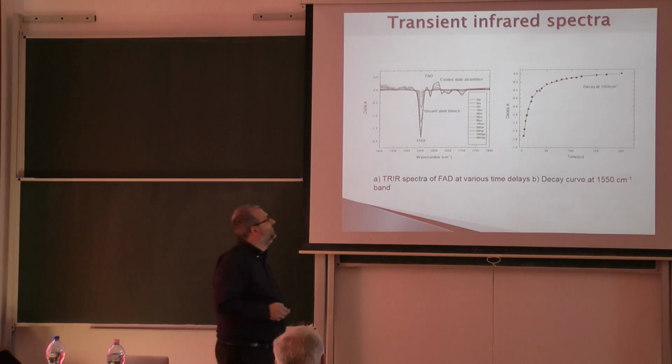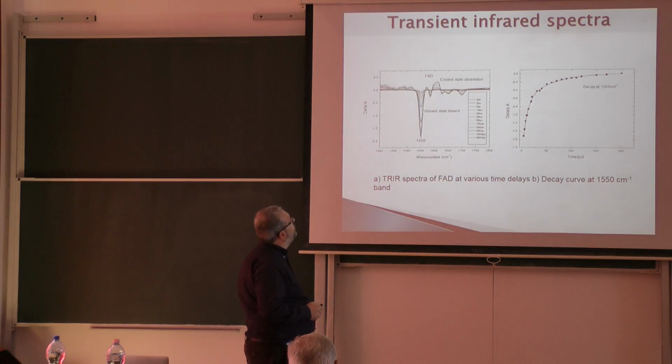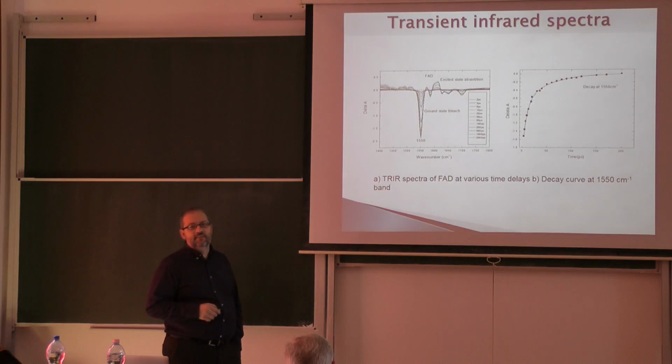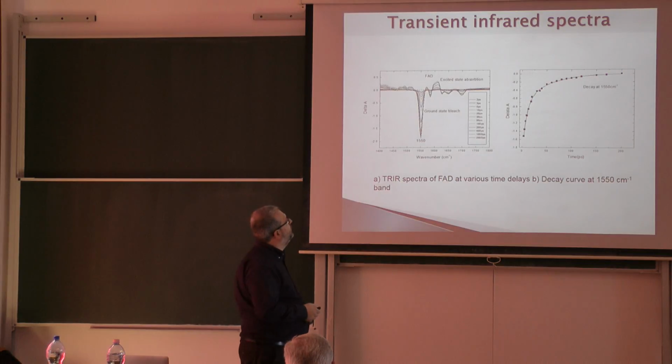Of course, what we have to measure is FAD, because this is the easiest. We can excite with 400, and we can have a very good high concentration of FAD. So this is our test measurement here. In FAD, we have a couple of interesting peaks.